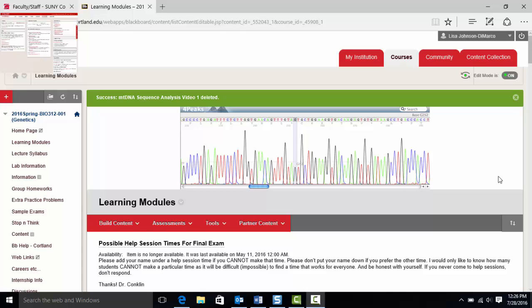Hey there, genetics students. In this video, I'm going to show you how to download your HVS1 sequence, how to clean it up, get the reverse complement of that sequence, and then get it ready for alignment with the reference sequence so that you can determine your haplotype.